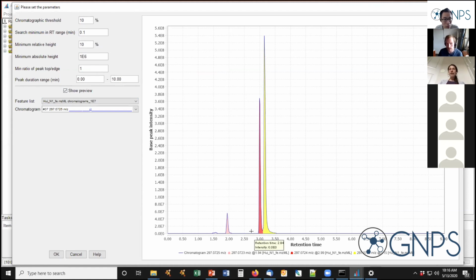So Daniel, now that we went through this local minimum search, maybe we could go through it again a little more slowly, since there are more settings. I think we did lose some people now.